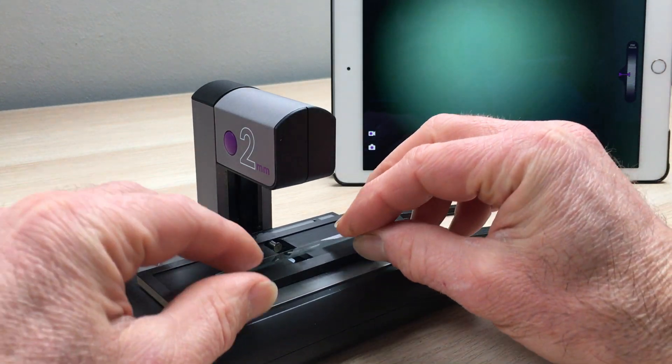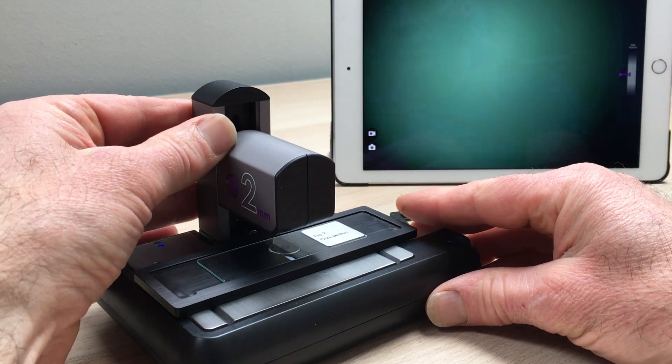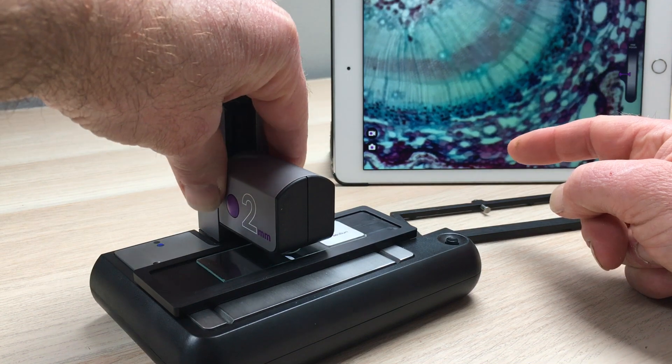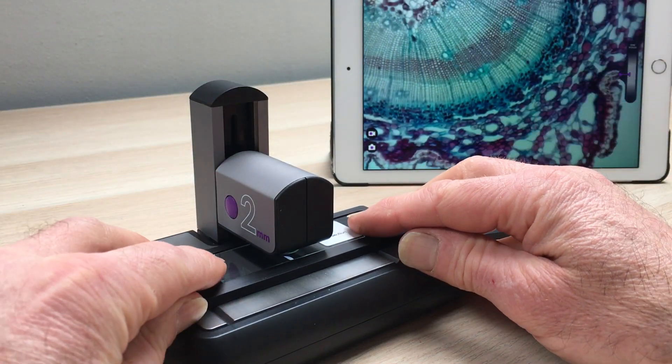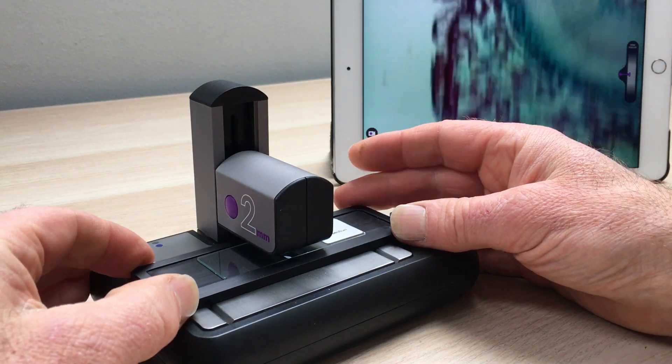You can then take your slide and clip the slide in. You can then slide down the microscope head to focus, and when you've got a nice focused image you can then translate the sample easily independently in the X direction or the Y direction.